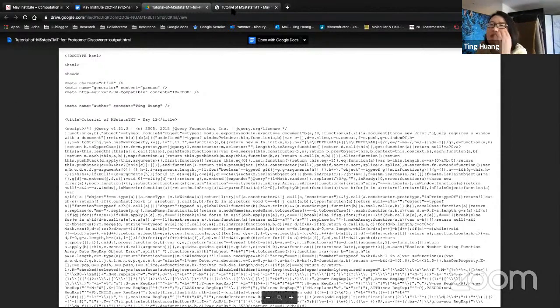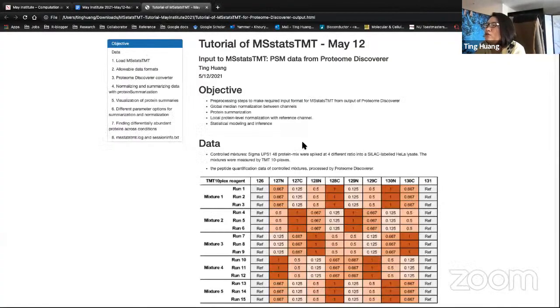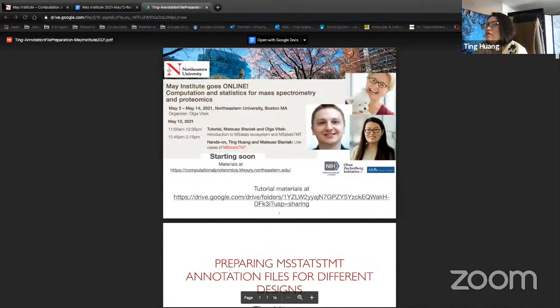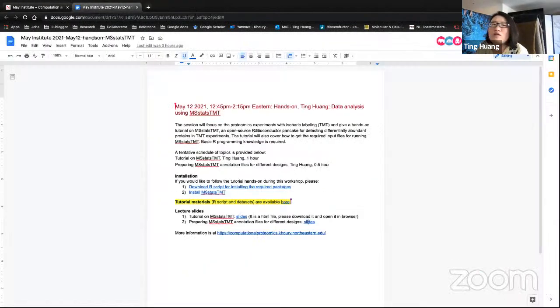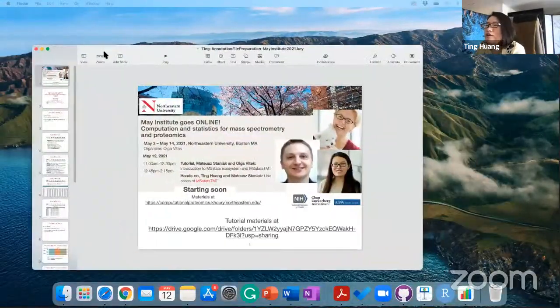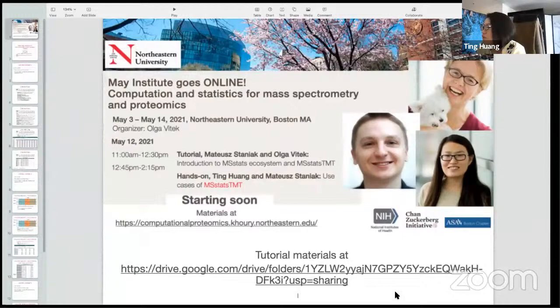Okay, so then we have the last 15 minutes. I would like to go over how to prepare the annotation file. So we will use the second slide set here. Let me open it.